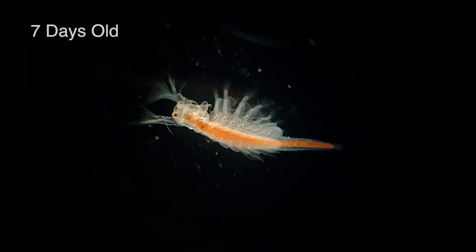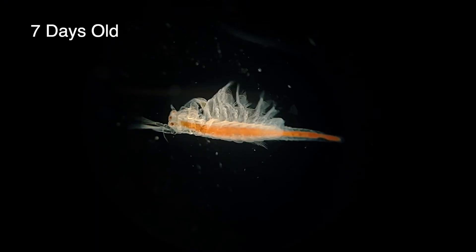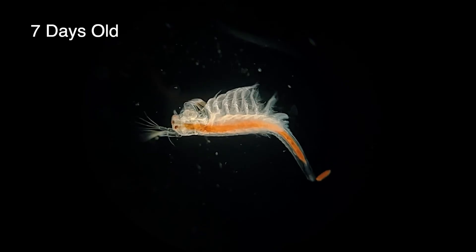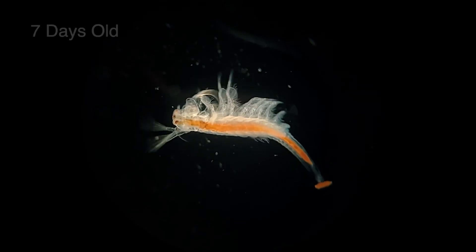At around one week old this thoracopod development is now almost complete. They have 11 pairs of these legs and they're now the primary appendages used for swimming. This one decided to do a poop while I was videoing it.